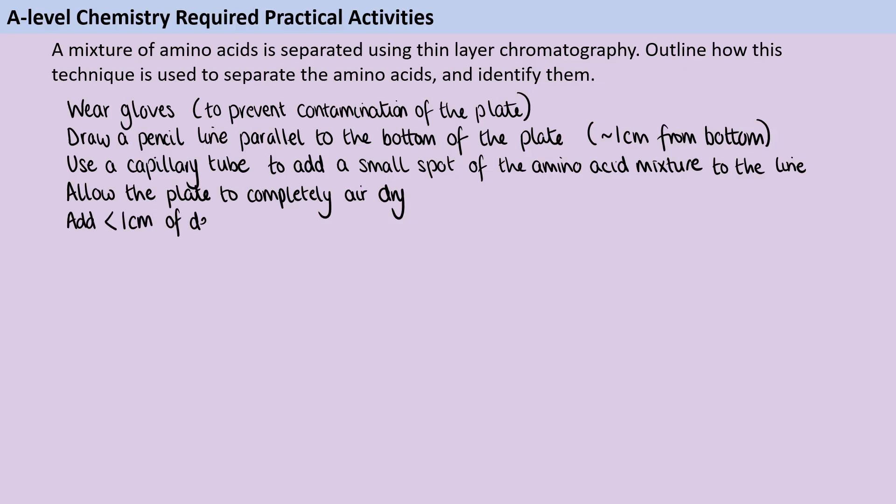We're going to add some solvent to the tank or you could just do this in a beaker, but it's important that the depth of the solvent is shallow enough that it's not going to go over that pencil line. Here I've said that my pencil line is a centimeter from the bottom of the plate so therefore I need less than a centimeter of that developing solvent.